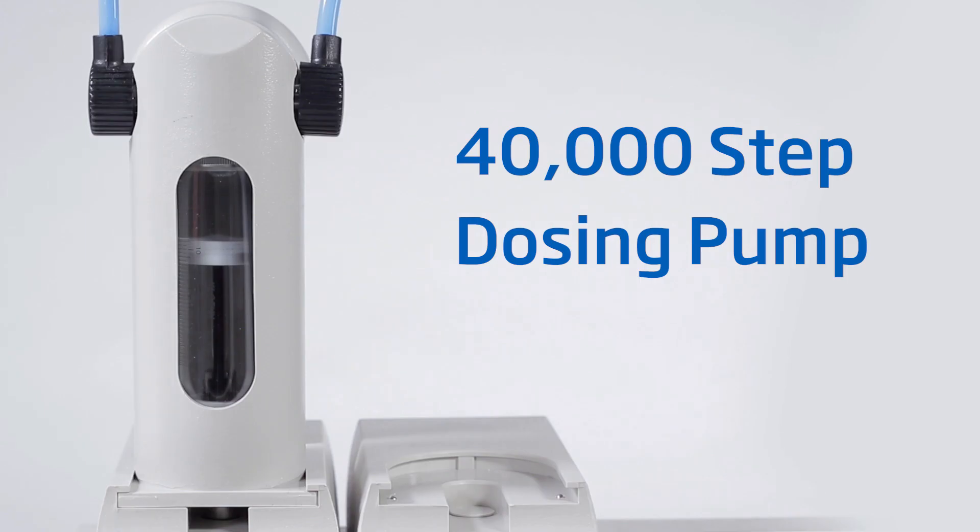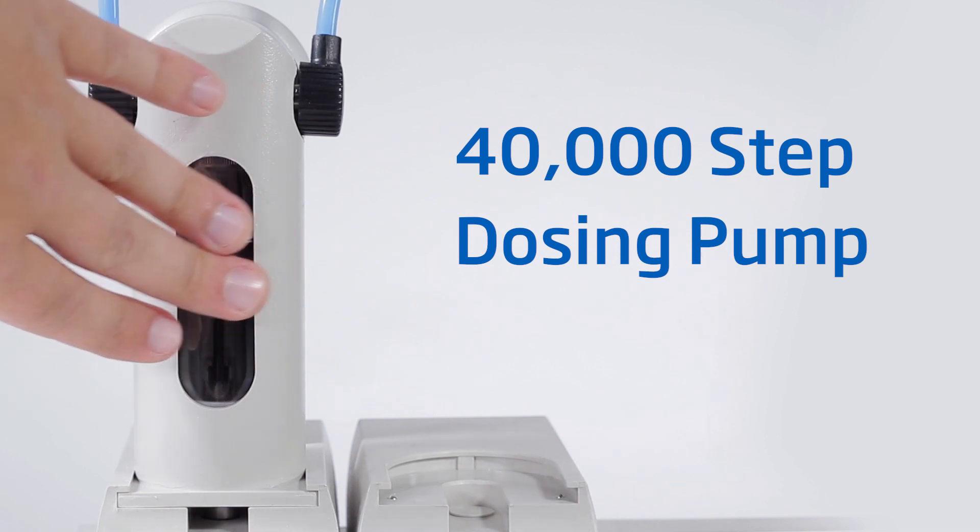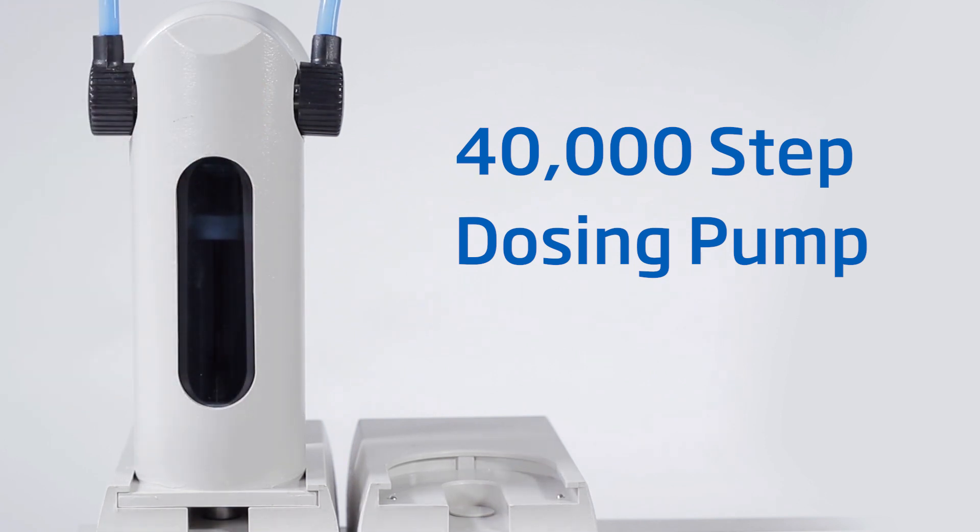Get accurate results every time with our unmatched 40,000 step dosing pump, which is capable of dosing extremely small volumes of titrant, helping you achieve a very precise endpoint for greater consistency.